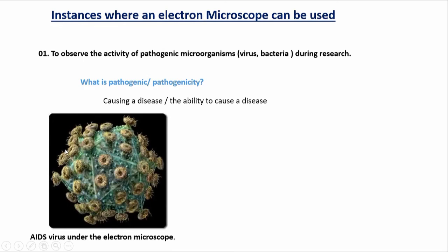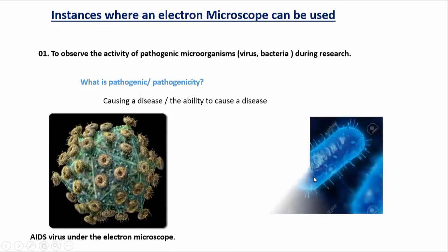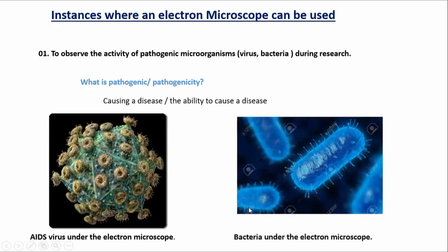So this is a picture of AIDS virus under the electron microscope. Here we have bacteria under the electron microscope. Okay, just for you to know.